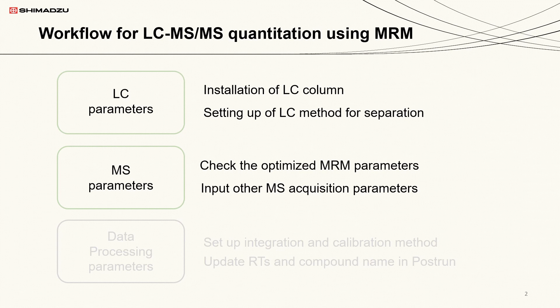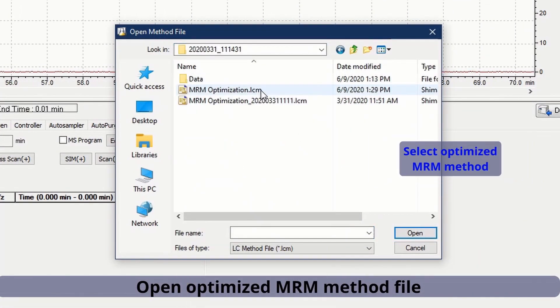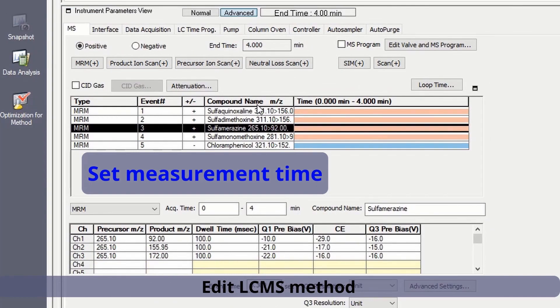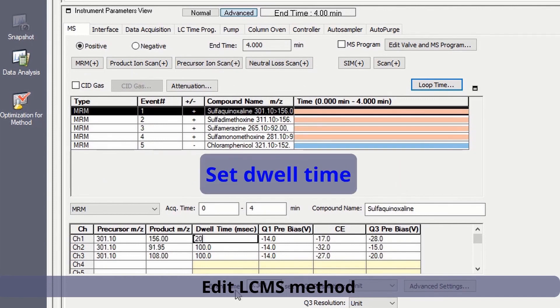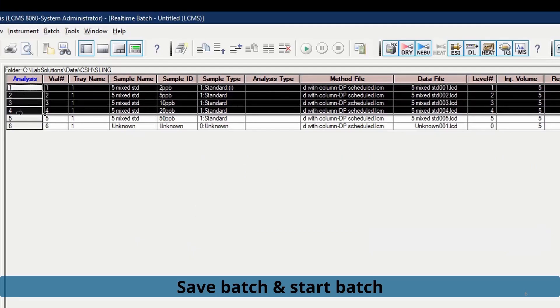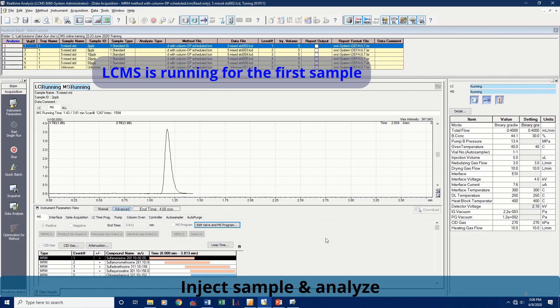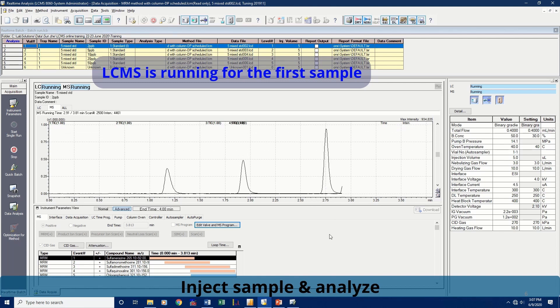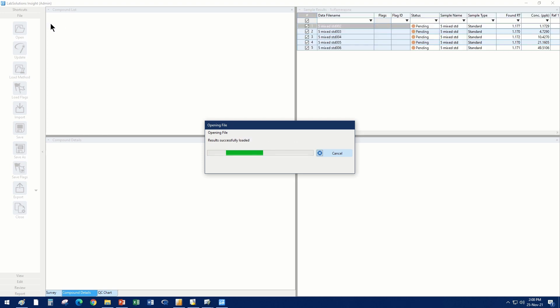First, we will install the LC column. Next, the LC gradient method will be set up for the separation of all compounds in a mixture, and other MS parameters will be input for the acquisition method in the real-time analysis window of LabSolutions. With this developed LC-MS-MS method, an automated batch run will be carried out for calibration standards. After data acquisition is finished, the data files with calibration curves can be reviewed in LabSolutions Insight software.